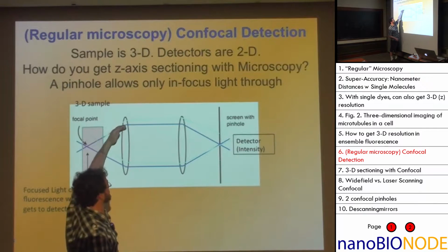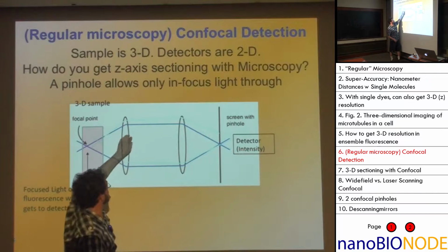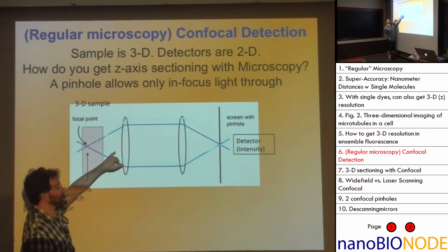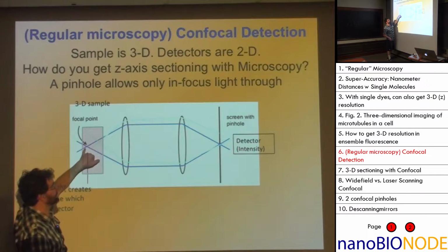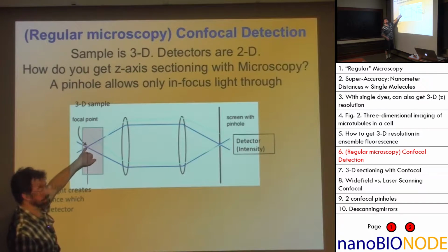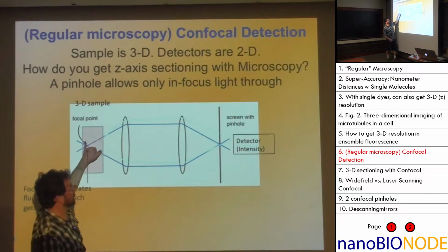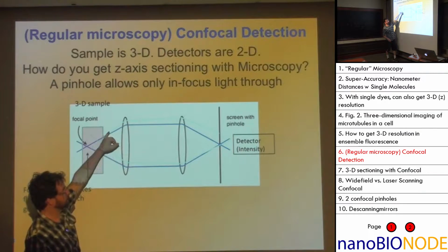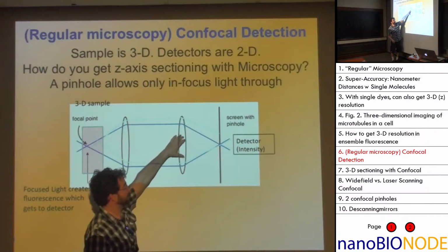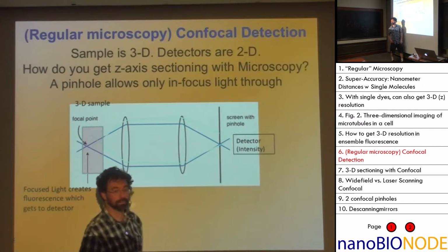Over here, it's bent. That is, this distance is exactly a focal length away. Then any object here, the light will come out being at the focal length, it'll be focused at infinity. And then this lens will take it back and refocus it right over here.